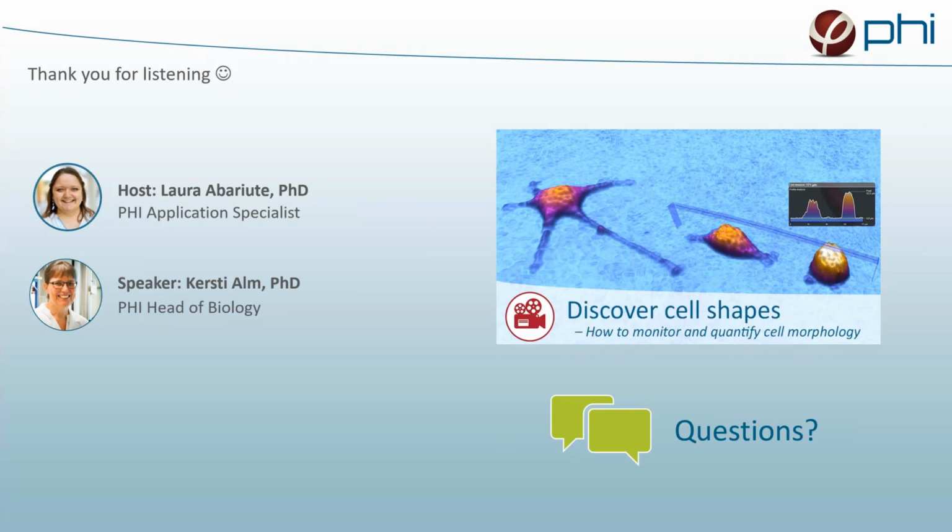Thank you. Then we have another interesting question from Ulf from University of Oslo. He asks, can I measure morphology on all types of cells? Well, I would say yes. You can use cell lines, you can use adherent cells, you can look at suspension cells, you can look at primary cells. There are physical limits. We have to be able to fit them into the microscope, but otherwise we can measure most kinds of cells, yes.